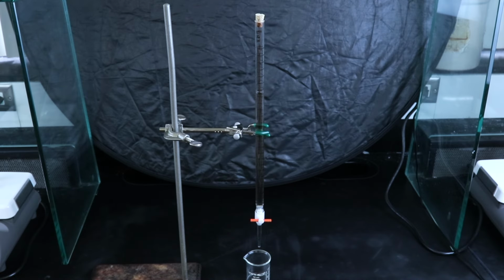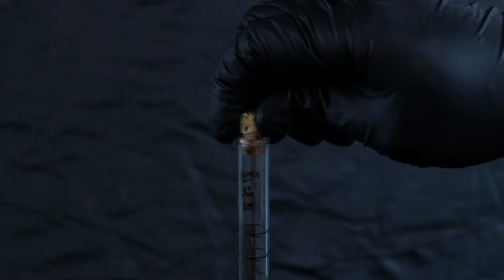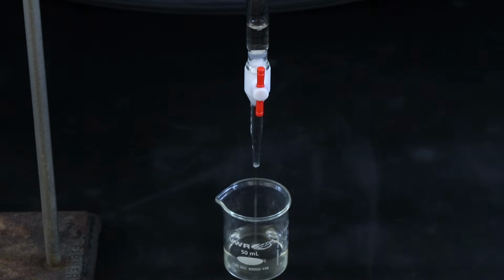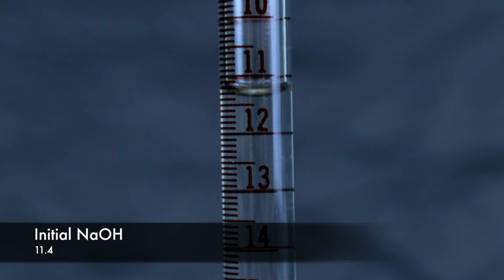And this is the burette that I'll be using for the titration, which is currently just filled with water, so I'll go ahead and remove the cork and open the stopper at the bottom so all of the water can be drained out. Once that's done draining, I'll close the stopper so that I can then add the standardized sodium hydroxide, which has a concentration of 0.181 normal. And I'll add that through a funnel at the top of the burette, being careful to accurately note exactly where the sodium hydroxide reaches in the burette so that I can measure exactly how much base is used in the titration process.